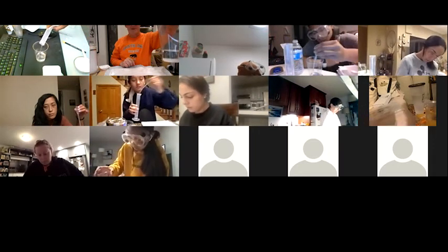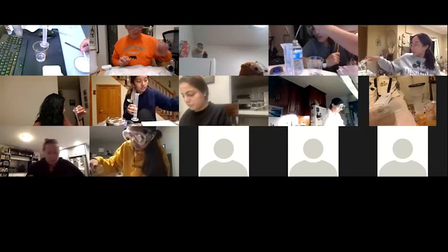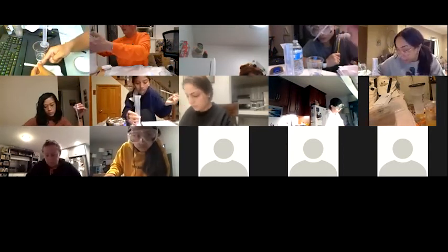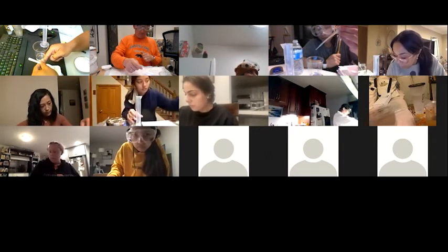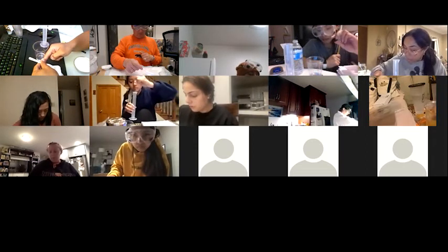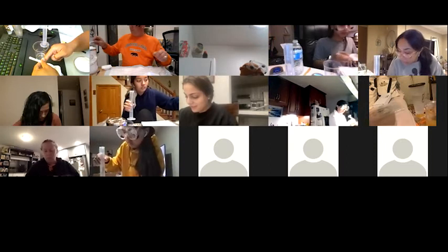Oh, was I supposed to put 5.5? Oops. So I need to put another half a gram of sugar in there. I made a mistake. So I need another half gram. I have to be super careful with this one. There we go.